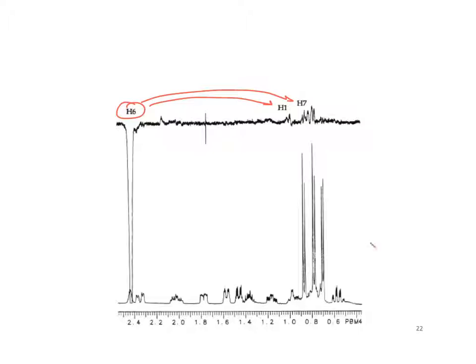Because you can also see signal around cyclohexane rings. You can see NOEs between diaxial protons and things like that. Okay, but only up to about 4 angstroms or something. It's just a small distance through space, so it has nothing to do with coupling, right? So for the NOE, they could be far apart in bonds, but if they're pushed close together in proximity, then we could get an NOE between them.